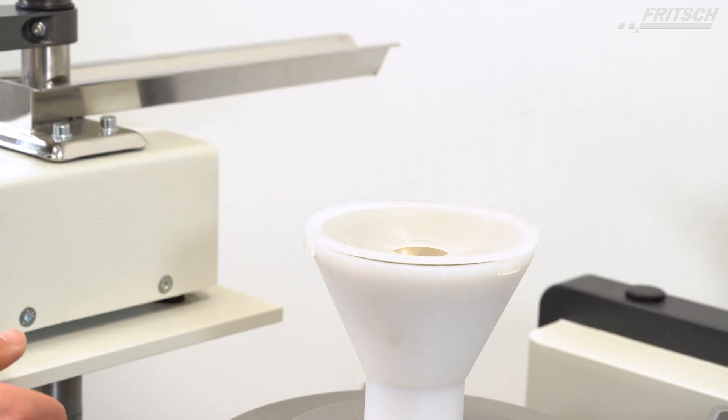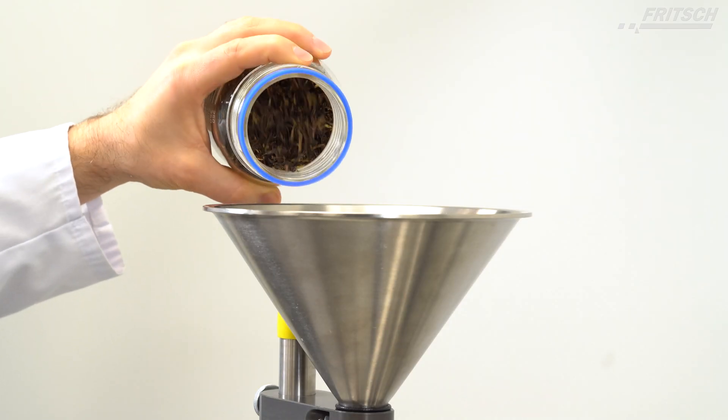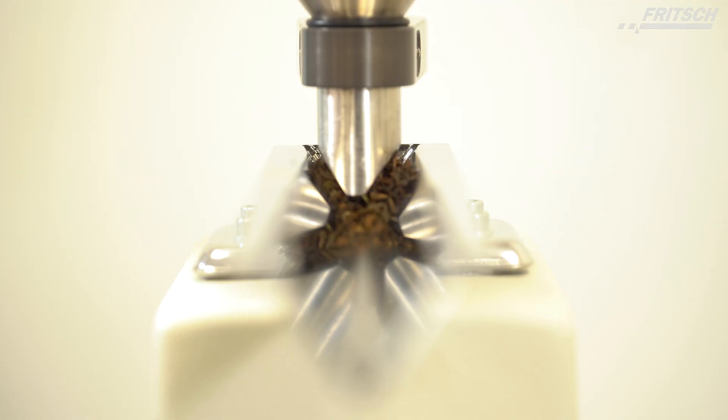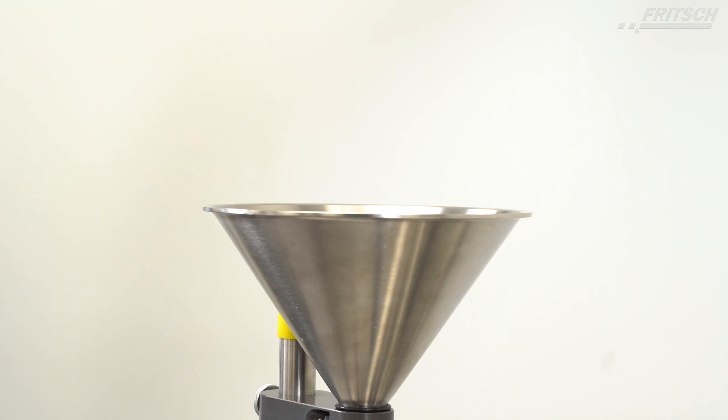Directly controlled by and precisely matched to the mill, the Fritsch Vibratory Feeder Labourette 24 always ensures the correct feed rate, ideal for the slow feeding of small material amounts or for grinding larger quantities.